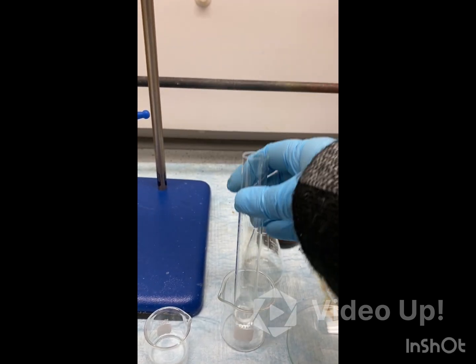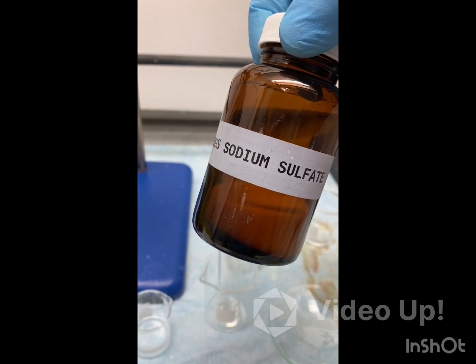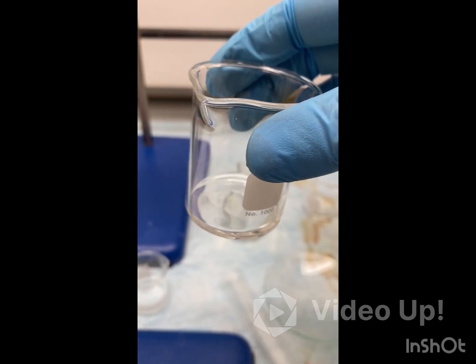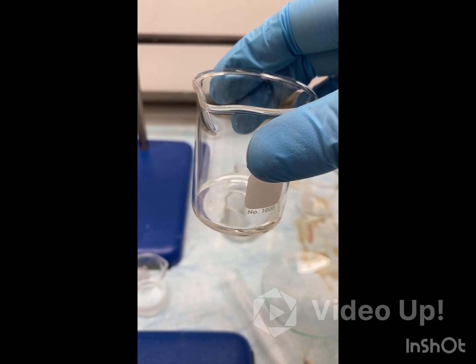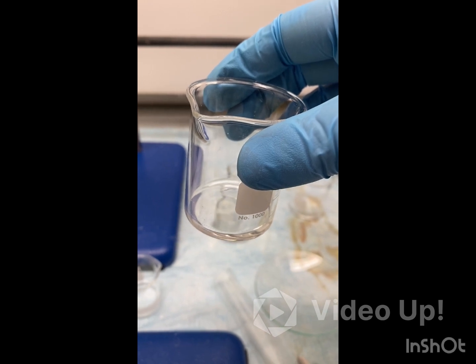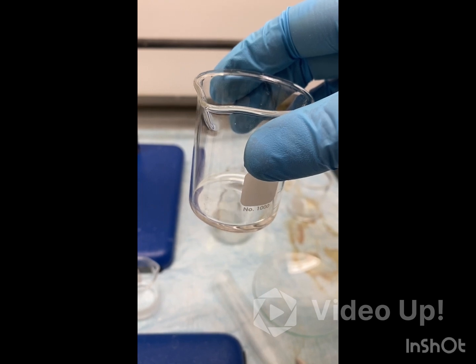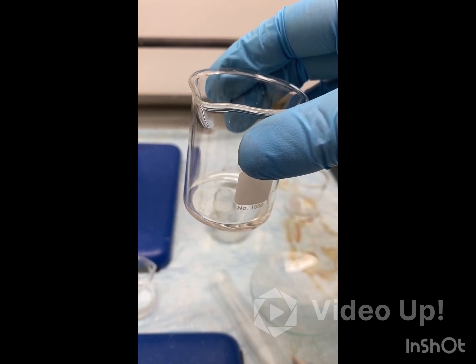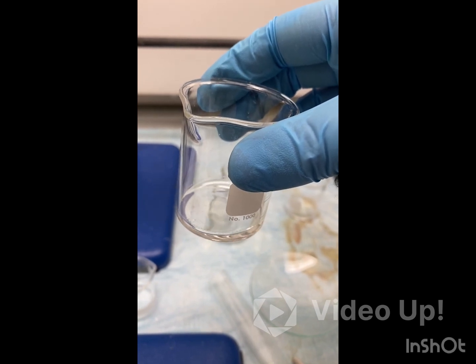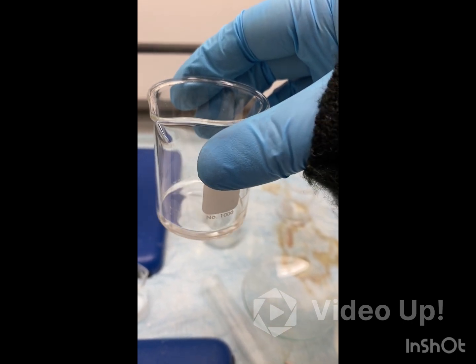We have our extraction, so now we're going to dry with anhydrous sodium sulfate. We have our product — now we're just going to let it dry. The result should be a sticky oil. If you do not have a sticky oil, you need to attempt to dissolve the water-contaminated product in about 2 ml of DCM, dry again with anhydrous sodium sulfate, filter off the sulfate, and then re-evaporate to obtain the sticky oil. After that, you're going to obtain an IR and interpret the NMR spectrum that's already on Blackboard.